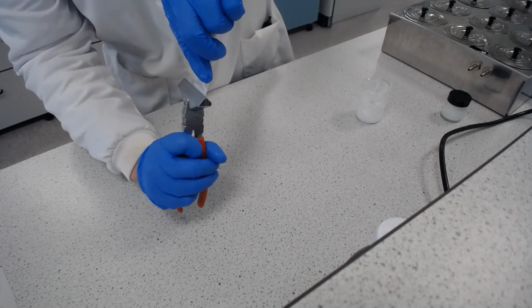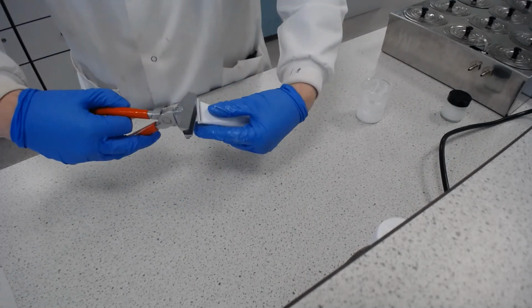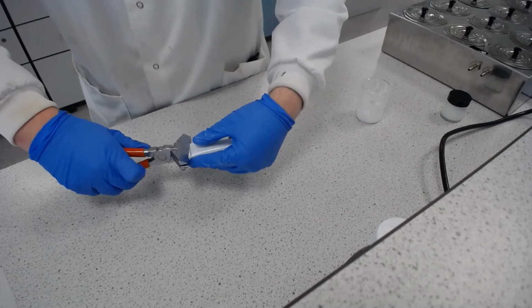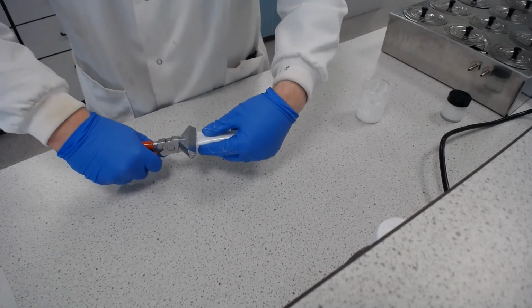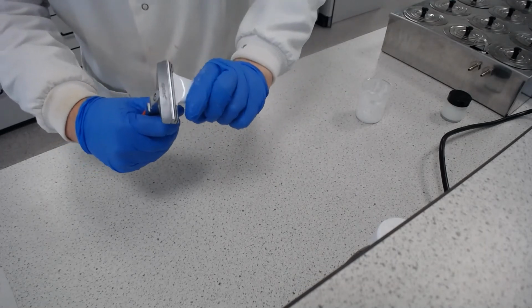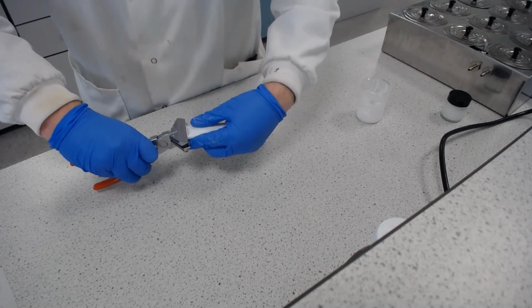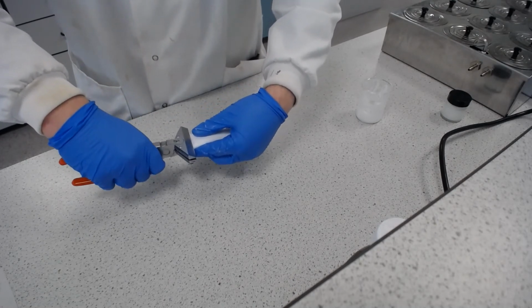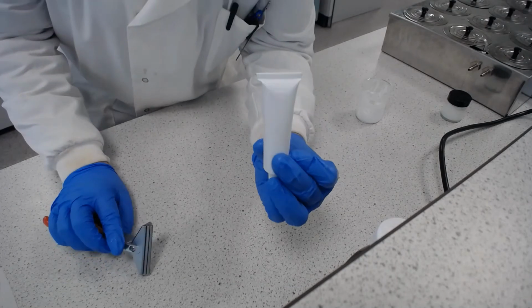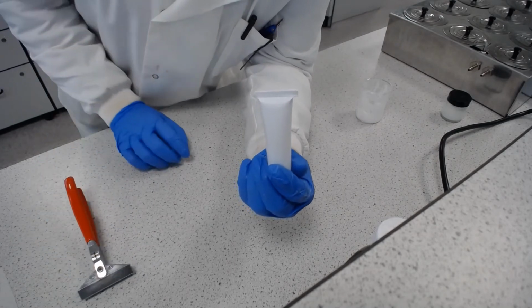into there and then turn to give me an even turn to seal the crimpers. And then we're going to do one more again in the same direction. Get that over and then seal that again, folding down the crimpers. And so you get a nice even back to the tube. Maybe I've done that slightly wonky, it could have been slightly better.